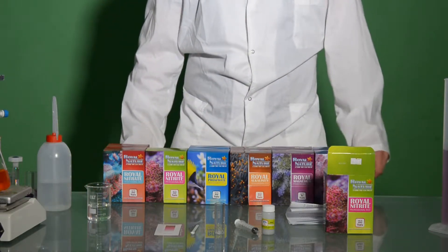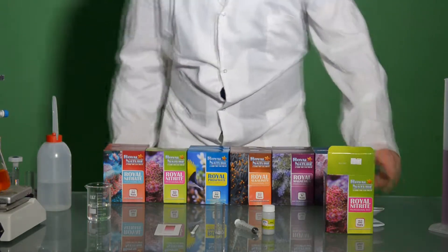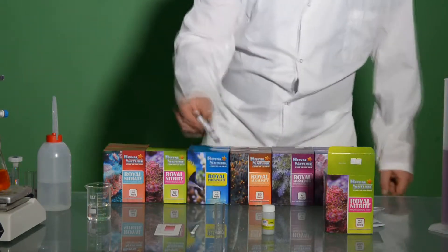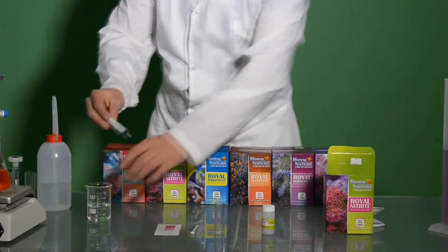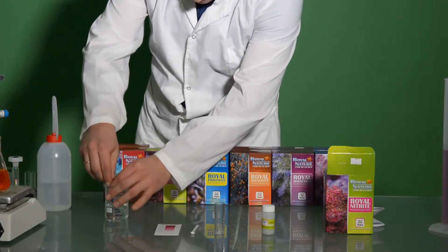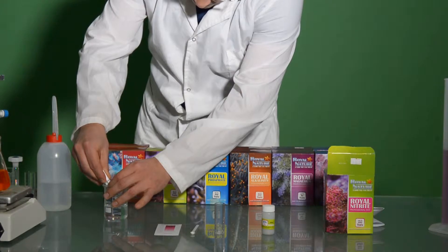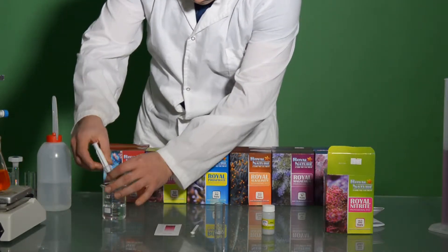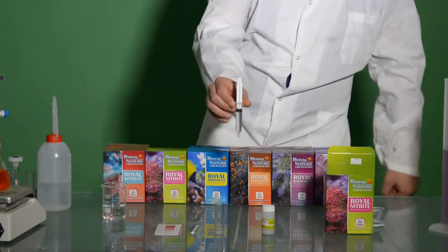So let's start with the test. First we'll take seawater where we don't expect to find any levels of nitrites. Using the 5ml syringe, we'll add 5ml of aquarium water to the test vial.